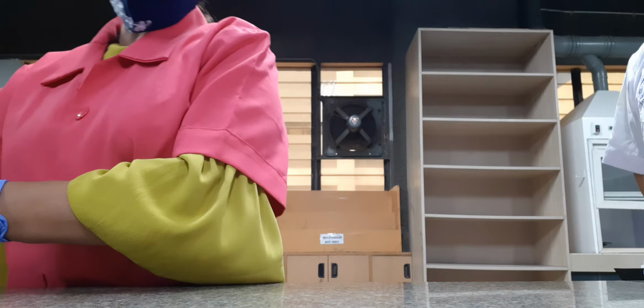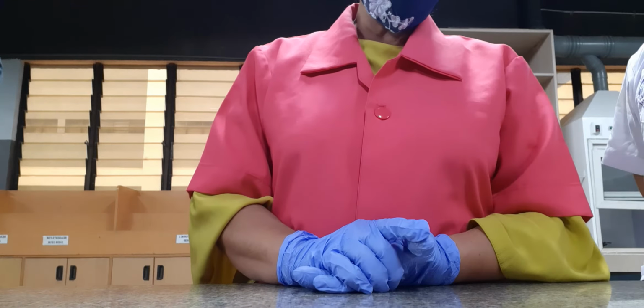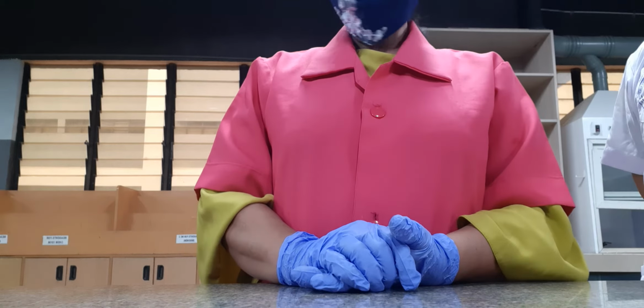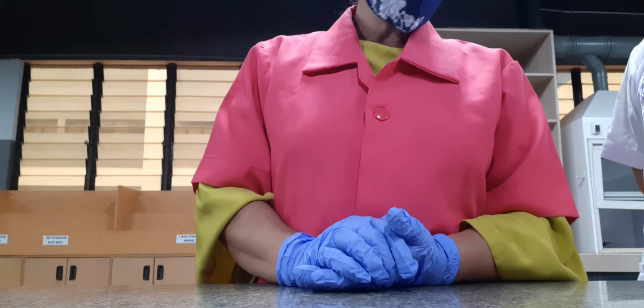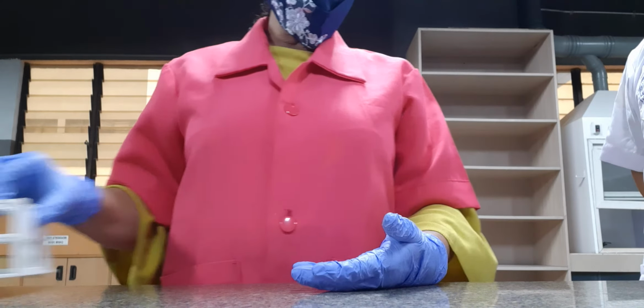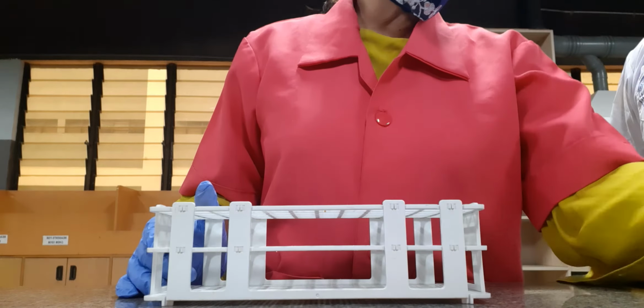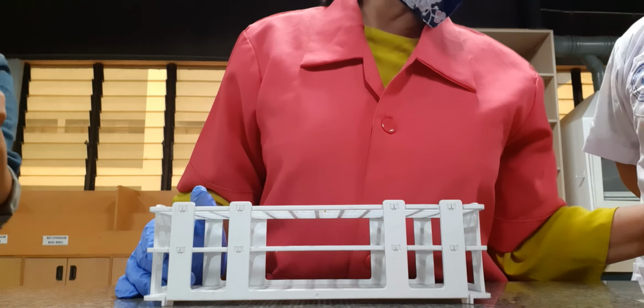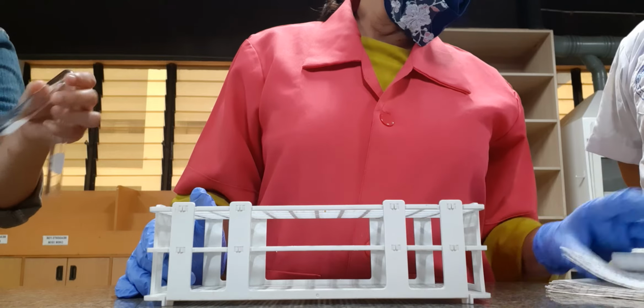Now we go for the oxidation test, using the different reagents that I introduced to you a while ago. We'll begin with test tubes 6, 7, 8, 9, and 10.